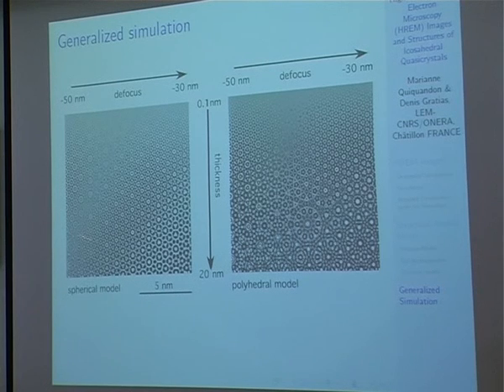We can differentiate between two models at large thickness, and we can use simulations to describe defects such as dislocations, because simulation and high-resolution electron microscopy images reveal the geometry of the materials.